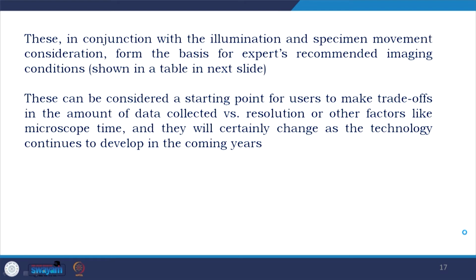We have developed a table. This can be considered a starting point for the users to make trade-offs in the amount of data collected versus resolution or other factors like microscope time, and they will certainly change as the technology continues to develop in the coming years. As you see, we have understood the basic physics principles to improve this. It is ensured that in coming years a lot more improvements would be possible.